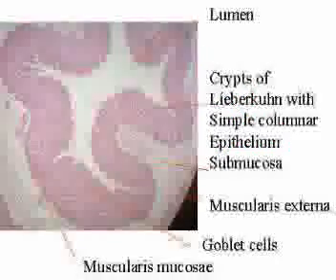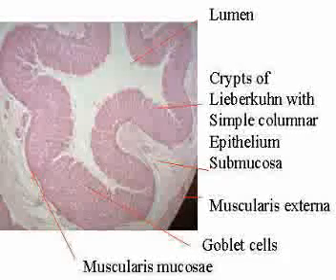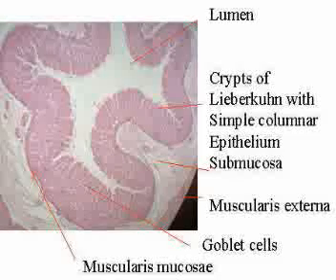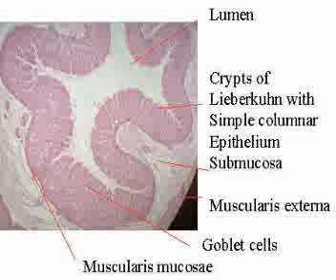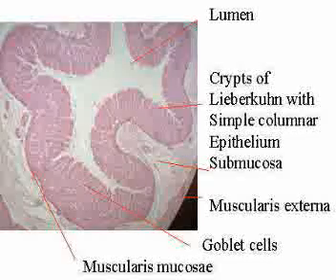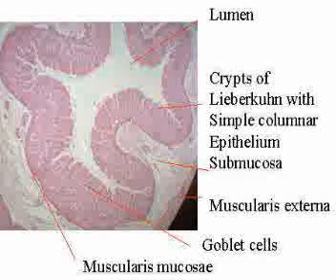Simple columnar epithelium. In this picture, the jejunum is thrown into circular folds with numerous epithelial crypts containing the core of lamina propria. Goblet cells which secrete the mucus are scattered around the epithelial layers, and the crypts, which are glands, having white cotton-wool appearance. At the end of the epithelial layer is a prominently stained muscularis mucosae.